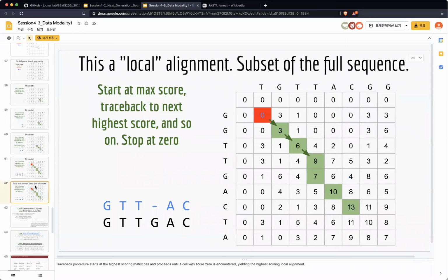So this is just a local alignment, so one part of your genome. If you do all of your genome information, it takes the genome-wide situation in your computer, and it will use much more computational resources to finalize this mapping, right?